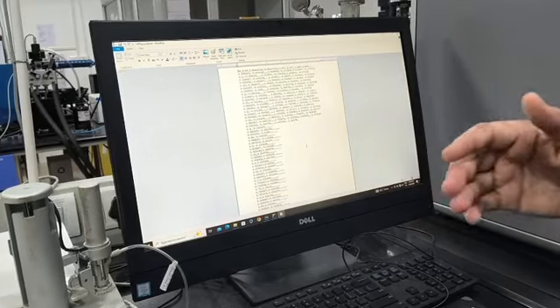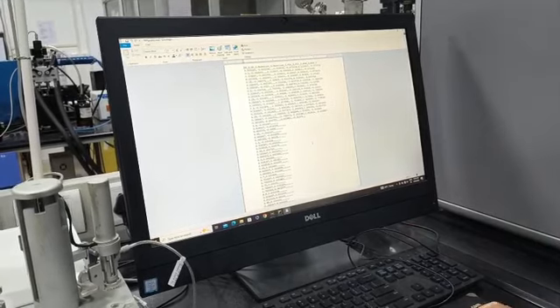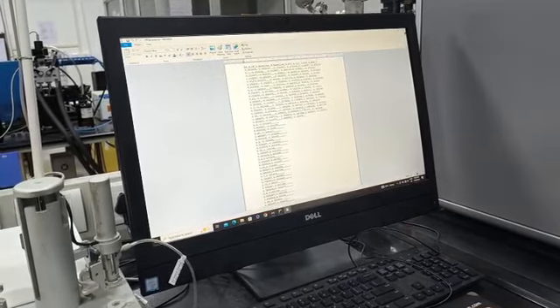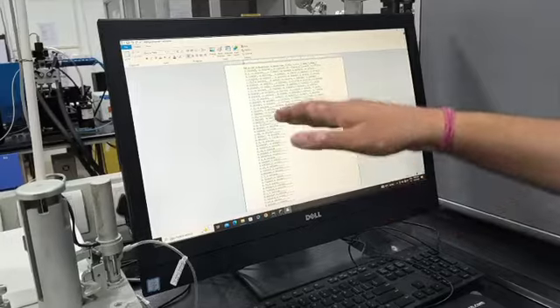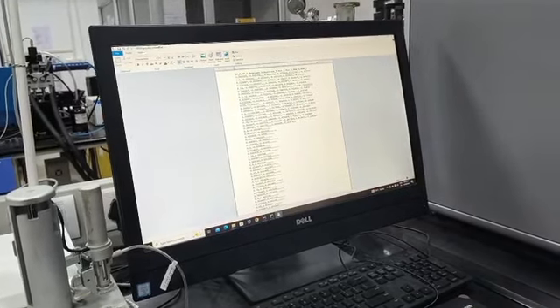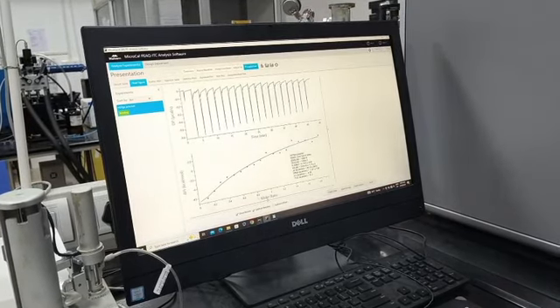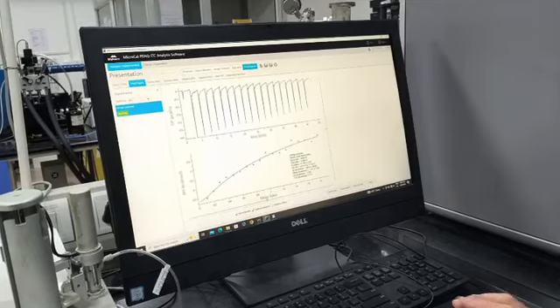So this is a CSV file, you can open it in any file format, just like Origin or your Excel. Just remove this data. This one is the x-axis and this one is the y-axis. So this x and y is basically these two things, delta H and molar ratio.